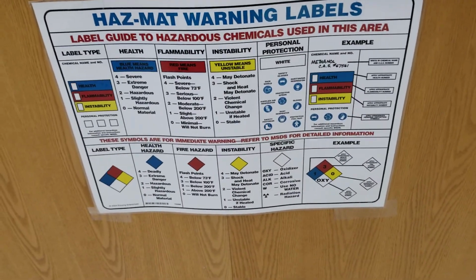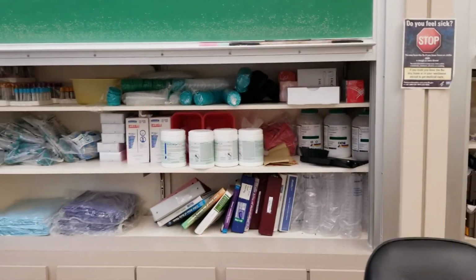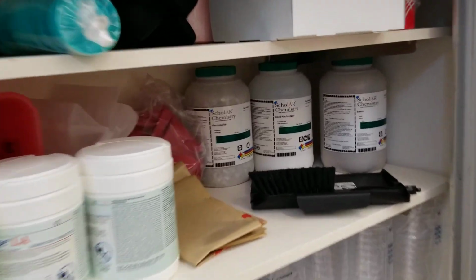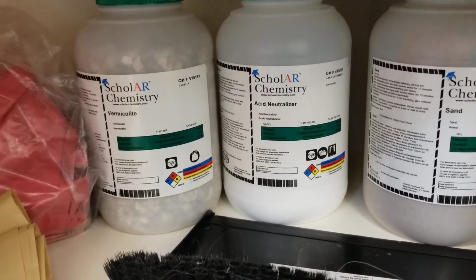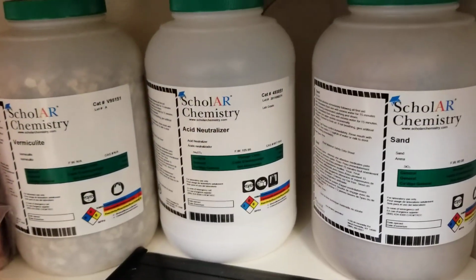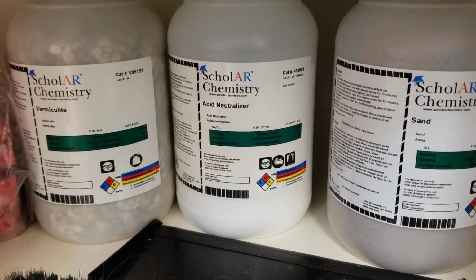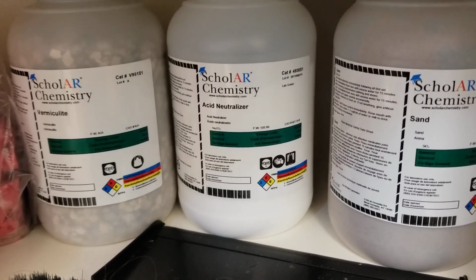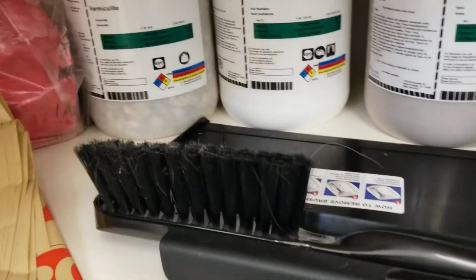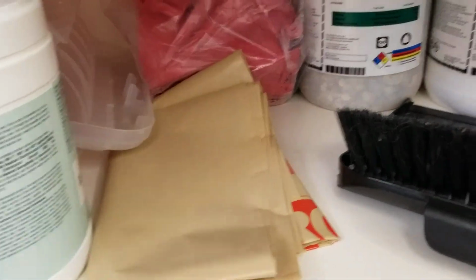If there is a spill of a chemical, we have two locations for our spill kit. Behind the demonstration bench, where there are four chalkboards, they rise up and there's storage behind it. And if you look, you have the chemical spill kit here. And depending on what the SDS says that you need, you would follow the procedure using one of these contents in order to inactivate, stabilize, or soak up the chemical that has been spilled. Then we have the dustpan with the brush that you can sweep it up and put it into a bag in order to dispose of it.